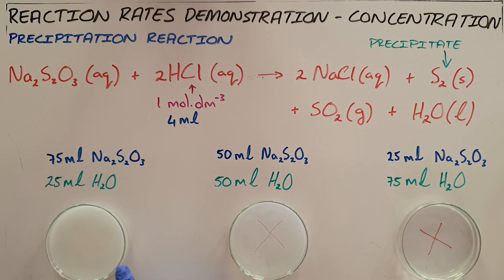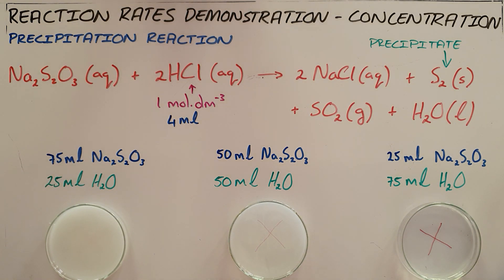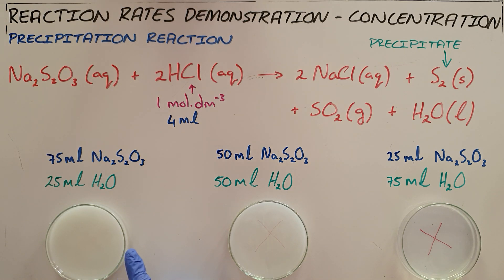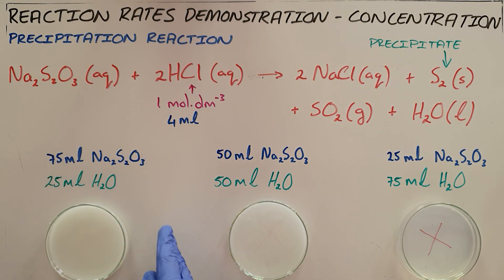Obviously you can't experience this, but there's also some gas being released that we can smell, and water and sodium chloride are also being formed. As expected, the higher concentration of sodium thiosulfate has resulted in more collisions — meaning more collisions per second, meaning more successful collisions — which results in a faster rate of reaction.